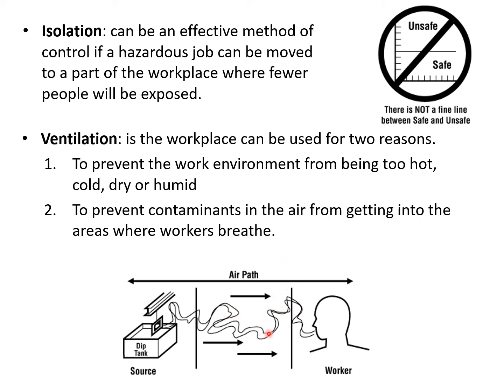In this picture you can see, for example, this is the source of the contamination or spread, and you can see the air path and how it goes to the persons or the workers whenever they take a breath. During breathing they can of course inhale it, but if we provide a ventilation area, then there are chances the air will not be too contaminated as it is close to these areas.